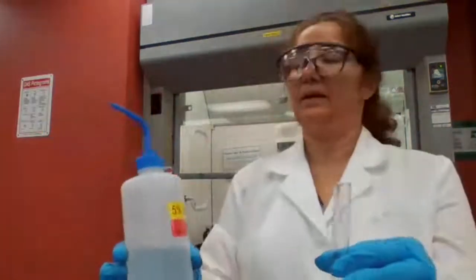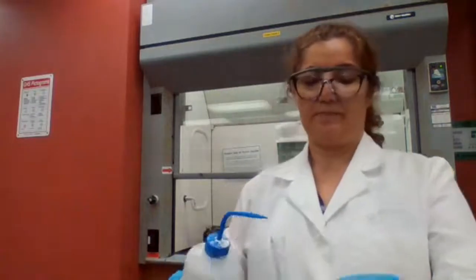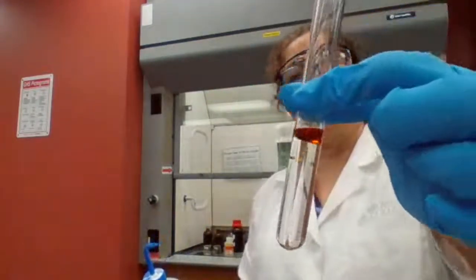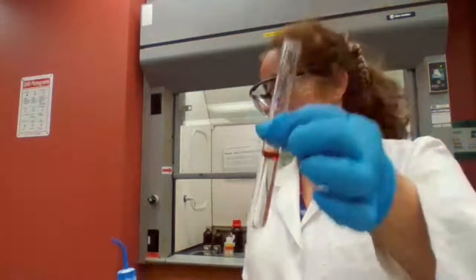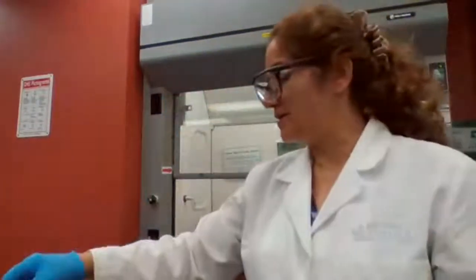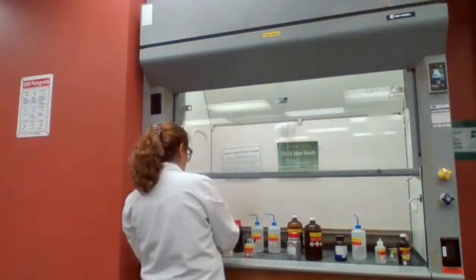Methylaniline in sodium hydroxide. Okay, not soluble. Methylaniline in sodium hydroxide, not soluble. Now I'm going to try the methylaniline in HCl.